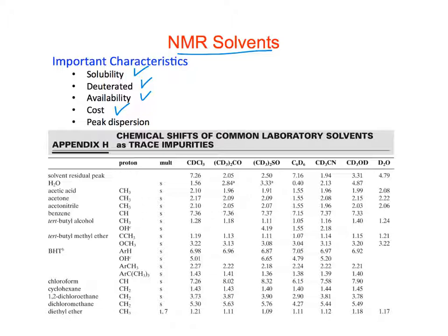For most synthetic applications, you have enough sample that you don't need a super high deuteration rate. But if you have tiny samples and want the residual proton signal to be small, you need a very high deuterium rate. In natural products chemistry, if you only have a milligram or less of sample, you'd like the percent of deuterium very high.